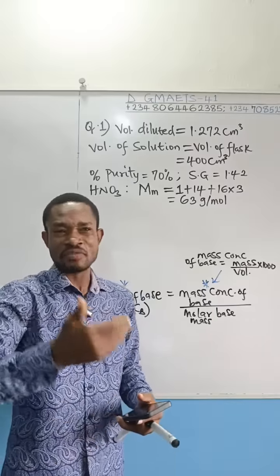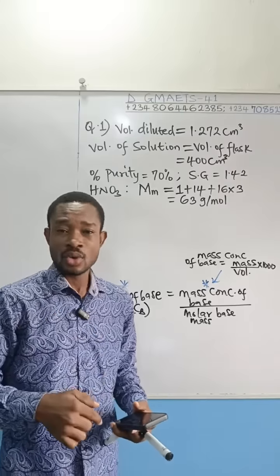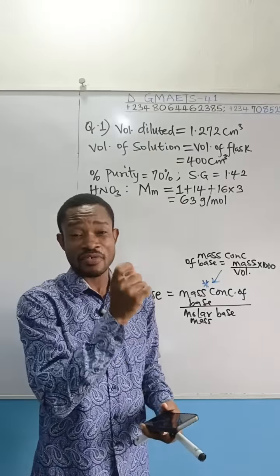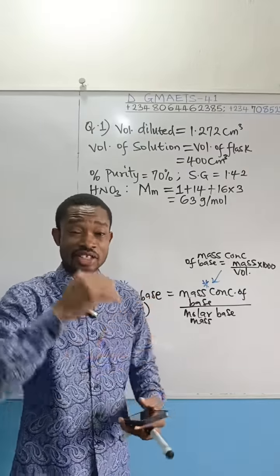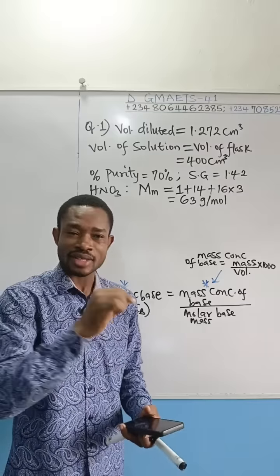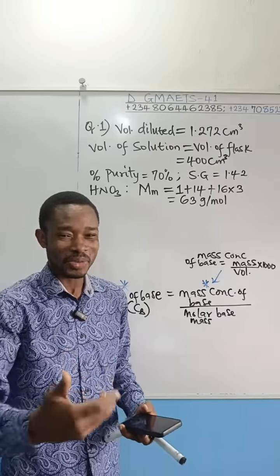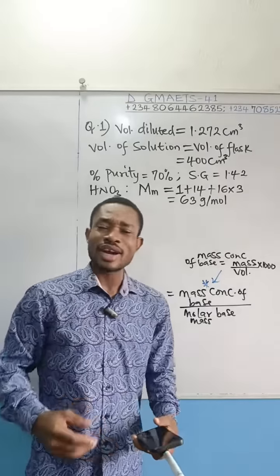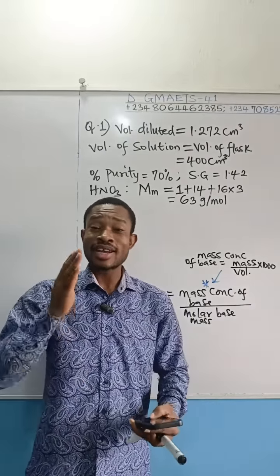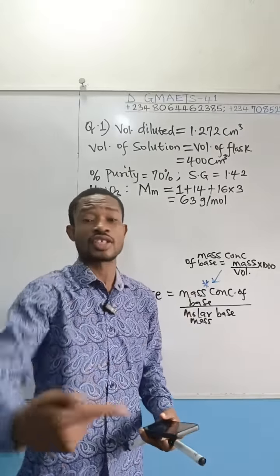You don't need to run first, second, third. All those things are a waste of time. We are talking exam now. The first experiment you run, the final volume of acid that changed the color, that neutralizes, you can use that volume of acid to, I'm sorry to say this, manipulate the result. That is why there are some titration questions, alternative to practical, where your examiner can give you the titer value straight and maybe require that you construct the table.